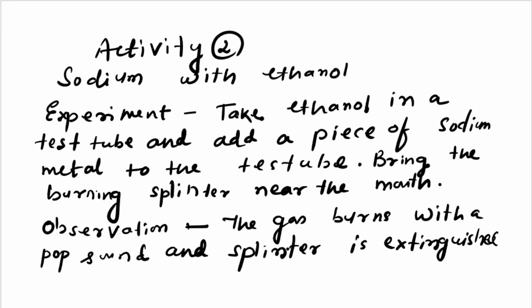Hydrogen always gives a pop sound, but if you add more, it is also dangerous. If by chance you take water instead of alcohol, it is very dangerous. An explosion surely takes place. So always, when you do any experiment with sodium metal, take a very, very small piece.